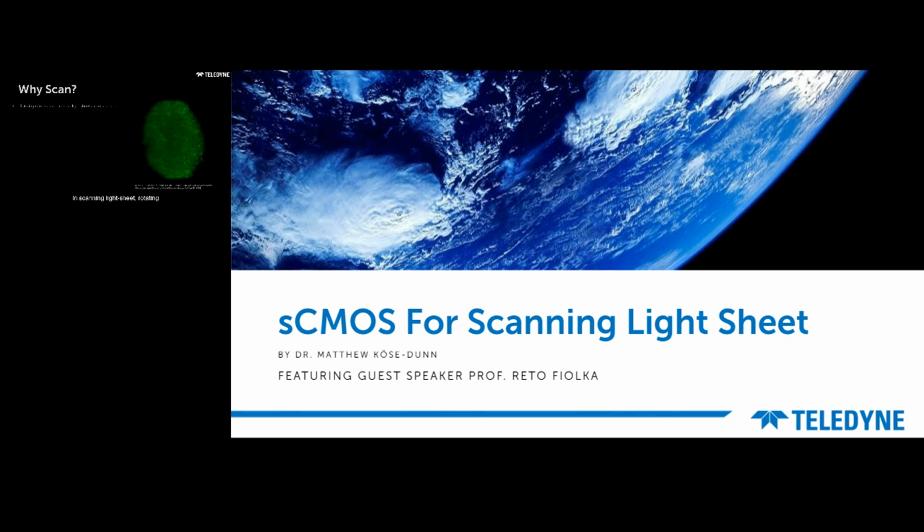In scanning light sheet, rotating mirrors are typically used to scan the light sheet across the sample. The ways in which this can be done can vary, but we'll get onto that in the next section. Overall, there are some other immediate benefits to scanning light sheet, such as imaging being less affected by irregular 3D shapes. As you can tell from the rotating image we've got here, in general, biology is rarely neat, tidy, or symmetrical, so samples are typically irregular and lumpy. And with some scanning, this can have less of an impact on image quality.